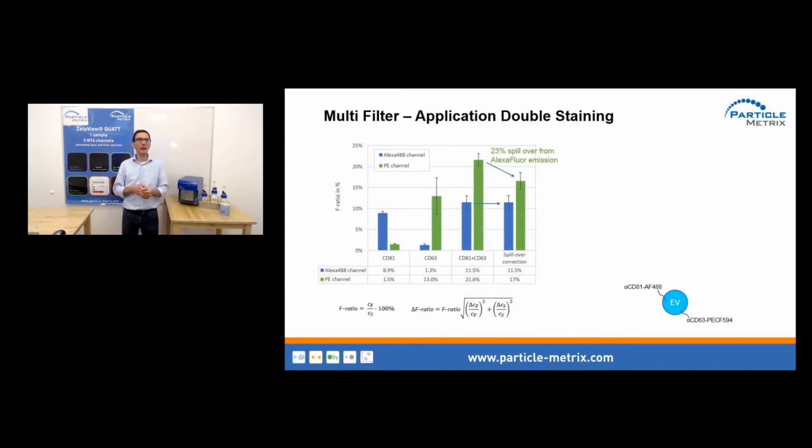Of course, in the Alexa channel you get the signal from the conjugation, and you should not get anything in the PE channel. There's always a little bit of background, but it is not big, so this works rather nicely. The same thing with CD63, you have the reverse situation.